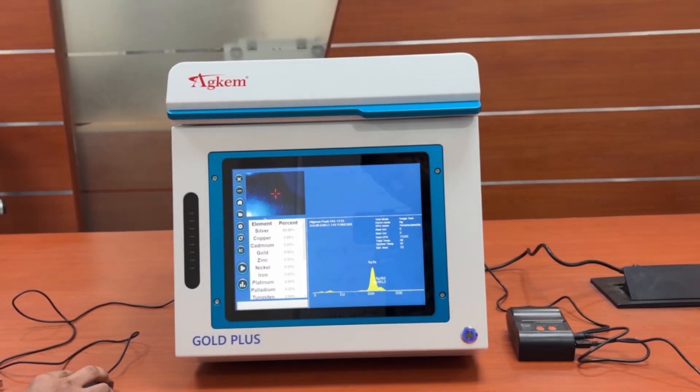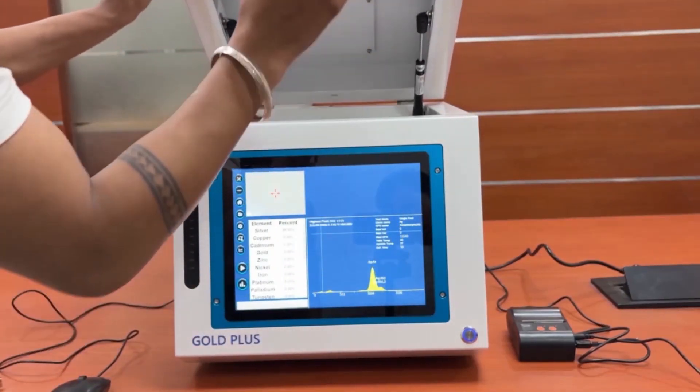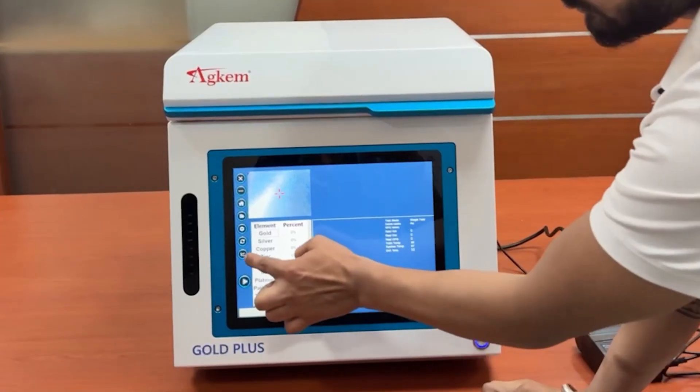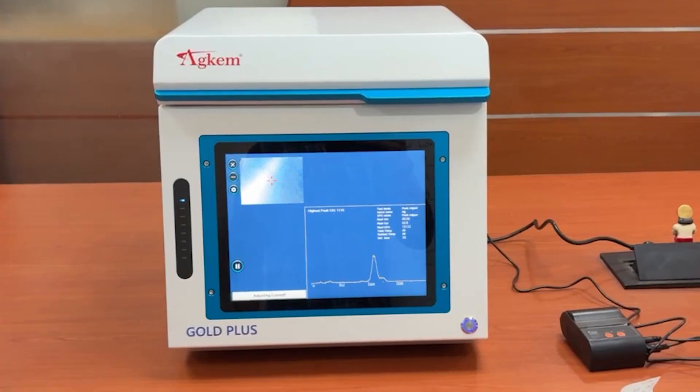After the instrument is turned on for the first time every day, please do peak adjustment once with the calibration sample. Place the sample on the test position. Click the peak adjustment button. Click OK.